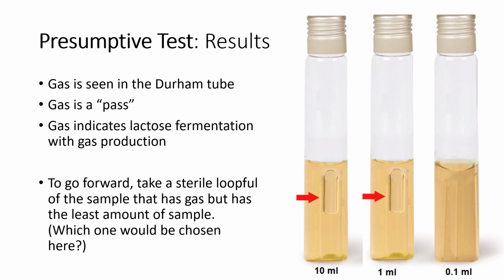Okay, so for some people, if we had done this in lab, some people, you come in with your well water, gee, I hope everything is fine. And all 3 tubes would have nothing. No gas in any of them. And you could leave and say with certainty that there's no E. coli and therefore no feces in that sample. Okay, those people would be happiest of all. This is one of these tests you want to fail.